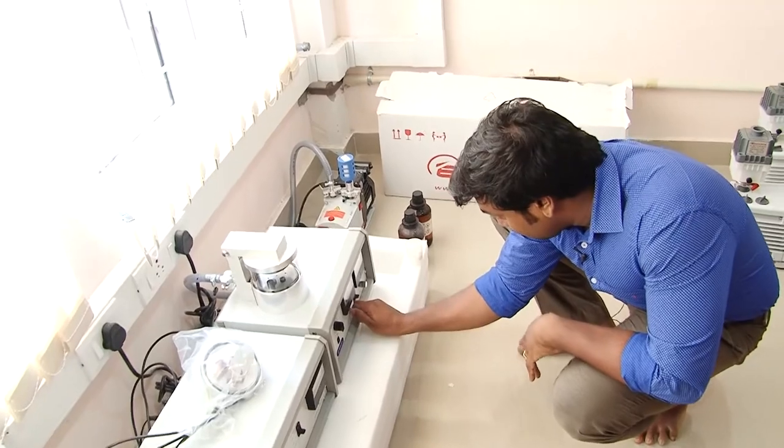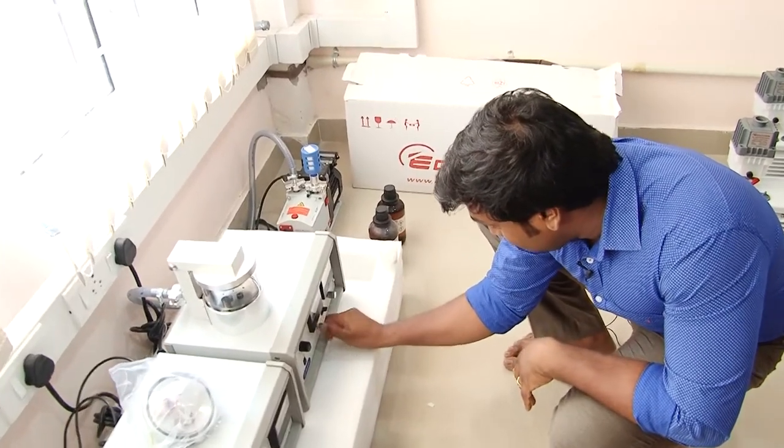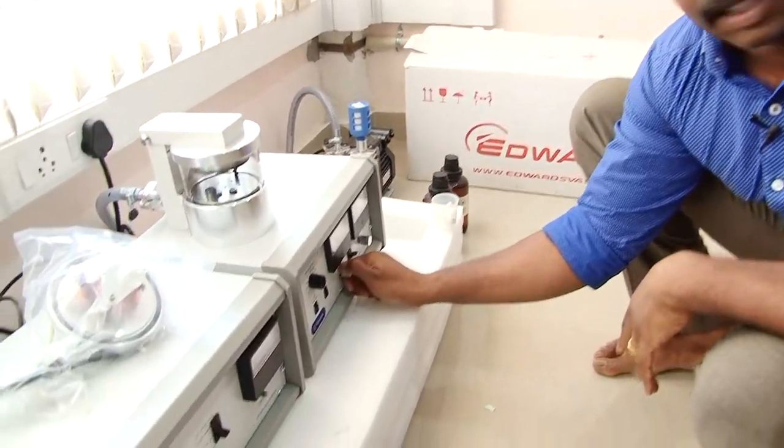So, sputtering is going on. Sputtering is going on. The current is 10 milliamps.